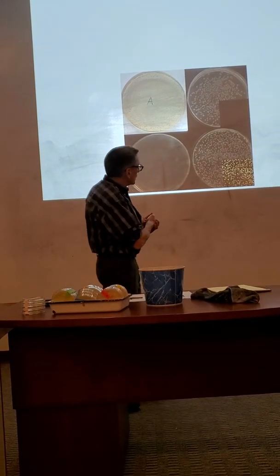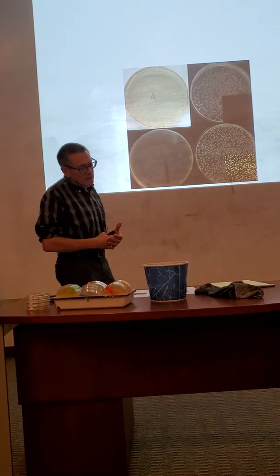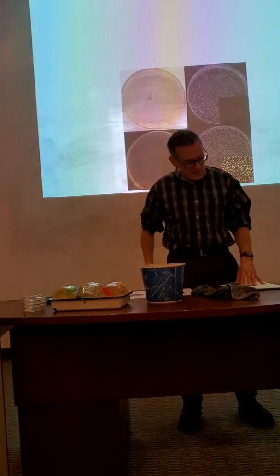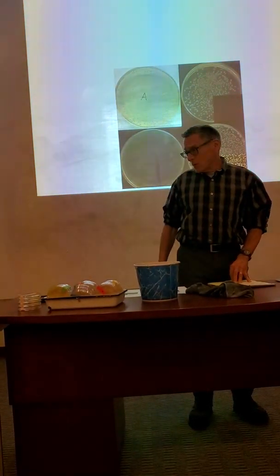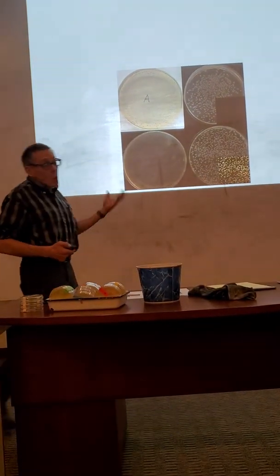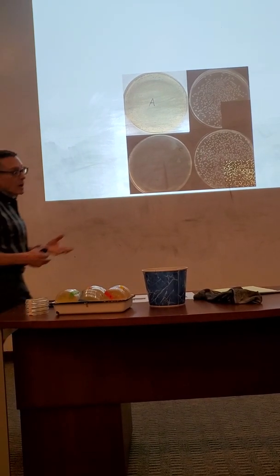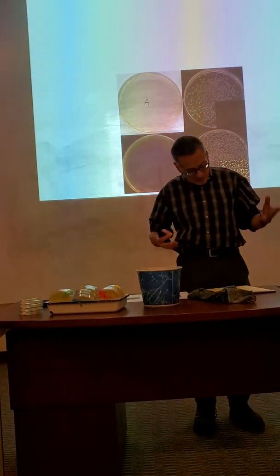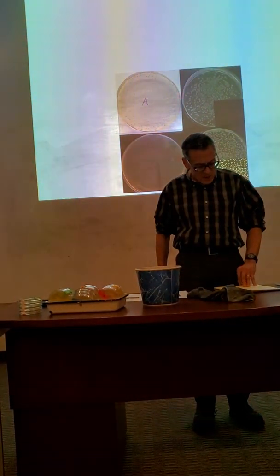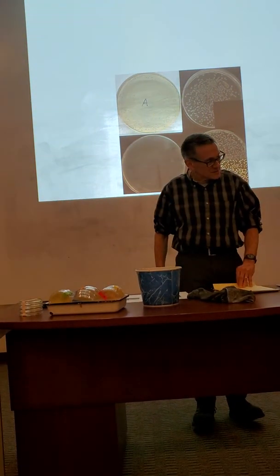The one I thought would glow glows. The one I thought would be white was white. The one I thought would be blue is blue. I think I'm just verifying my expectations going in. Maybe the one thing we do learn, we didn't know if there was a LAC-Z gene on plasmid D. There certainly does not appear to be. Whether there was before they shoved Lux into it, I guess we'd have to sequence the DNA to find out. I suppose you could even suggest that to see if LAC-Z is there.